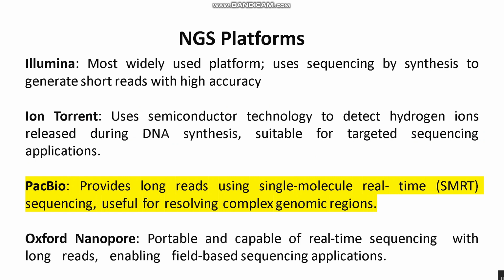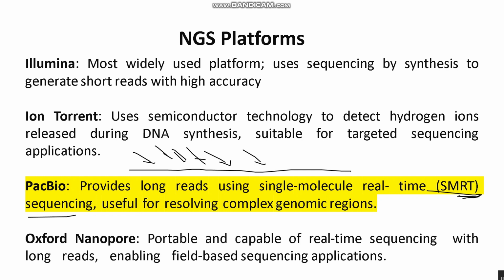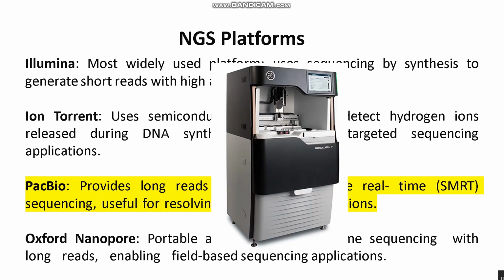In PacBio, SMRT sequencing occurs. No termination is required, and real-time sequencing can be measured by PacBio. No termination. This is the machine.